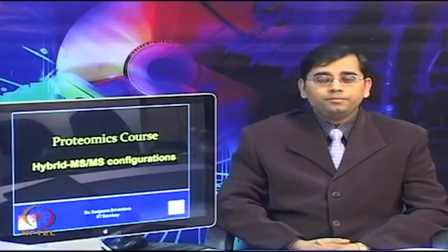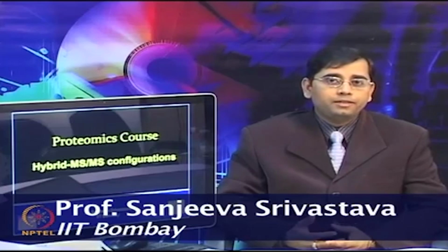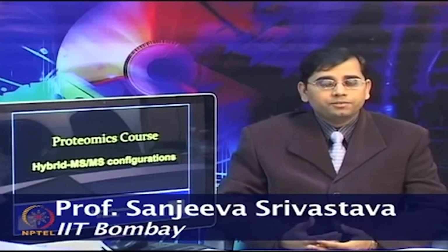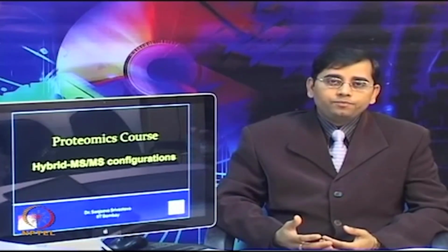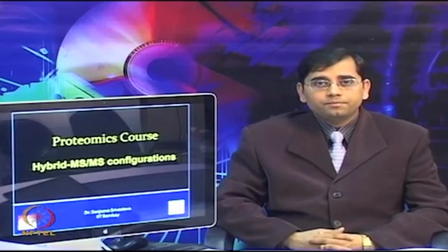Today we will talk about hybrid MS-MS configurations. As we have discussed, there are different types of mass spectrometers available, and depending upon the mass analyzers and how they can be used together, different types of MS-MS configurations, hybrid MS-MS, have emerged. We have discussed that different types of hybrid MS or tandem MS can be used for various proteomic applications.